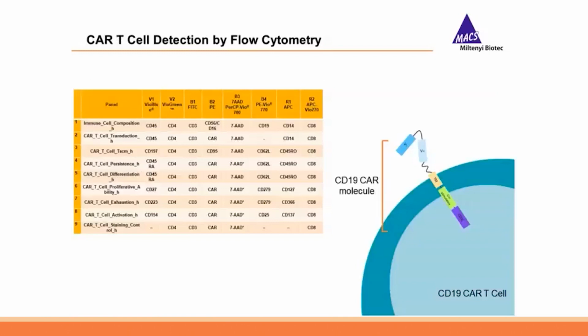The considerations on the choice of the best reagent for identifying the CAR molecules are quite similar to those one has to think about when picking the right clones and antibodies for analyzing other parameters on, for example, T cells. However, it becomes even more critical when one wants to reliably analyze the expression of the CAR molecule.